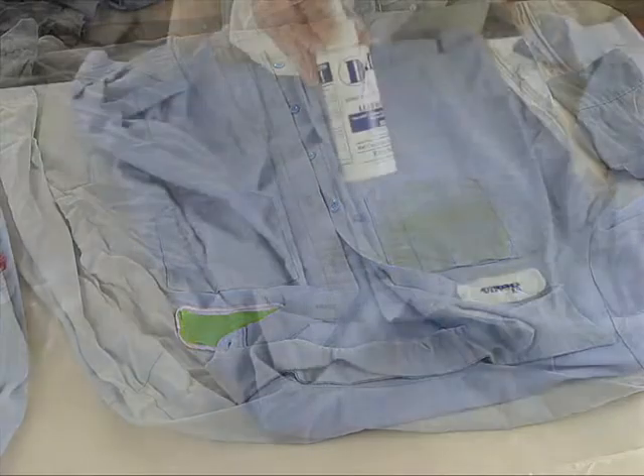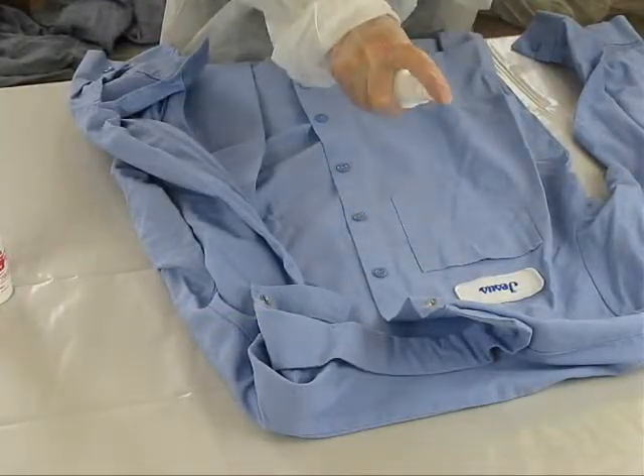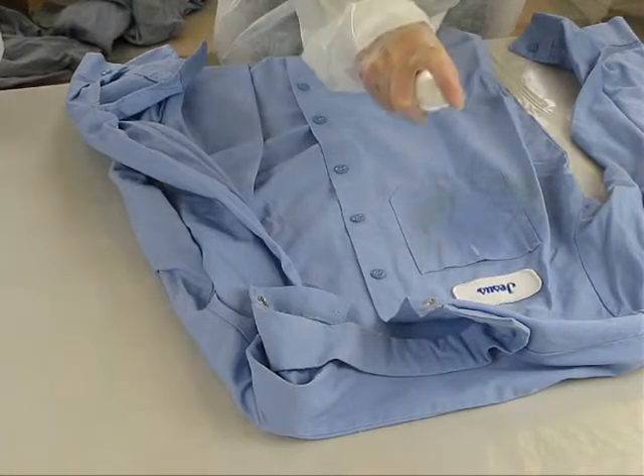In this next test, we are testing a shirt that looks clean using the direct test method on the pocket area. Even visibly clean clothing may still contain significant amounts of lead.